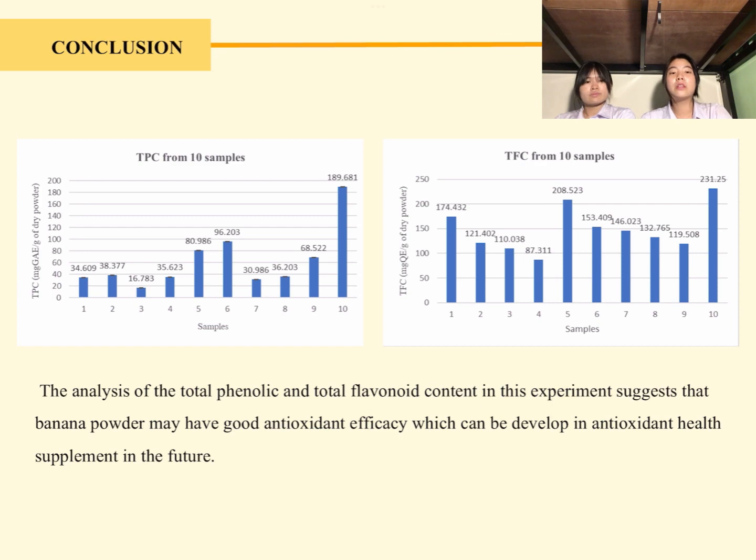For the conclusion, the analysis of the total phenolic and total flavonoid content in this experiment suggests that banana powder may have good antioxidant efficacy, which can be developed into an antioxidant health supplement in the future.